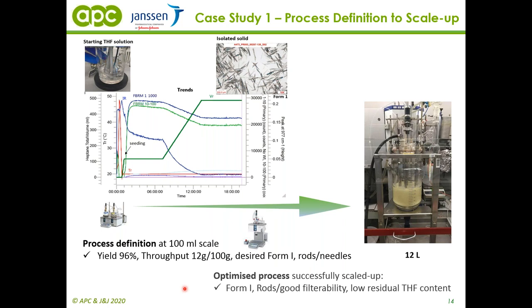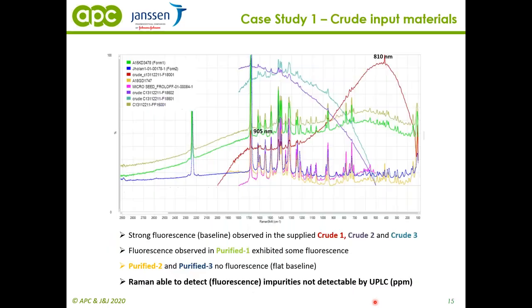This was optimized and fully scaled up to 12 liters. This was done at our colleagues in CTU, and during the scale up, there was the right form, good filterability, and low residual THF content. So a good process.